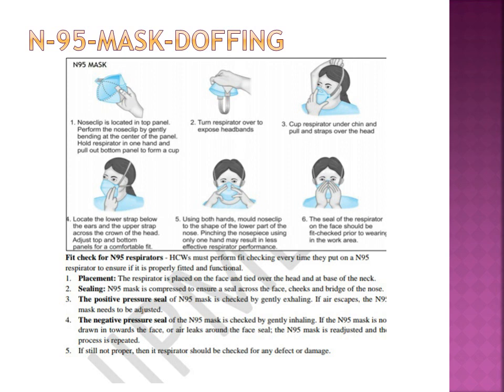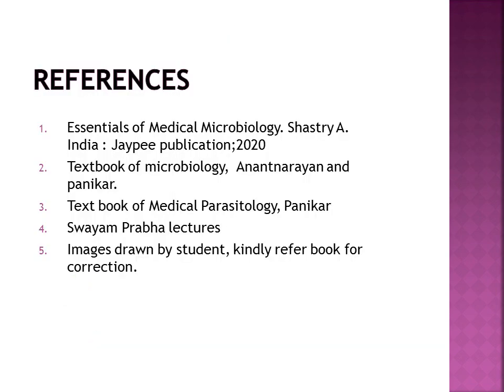How to remove a mask? Wash hands thoroughly, remove the mask by holding the strap, then discard the single use mask, and wash your hands again. These are my references from which we can study.